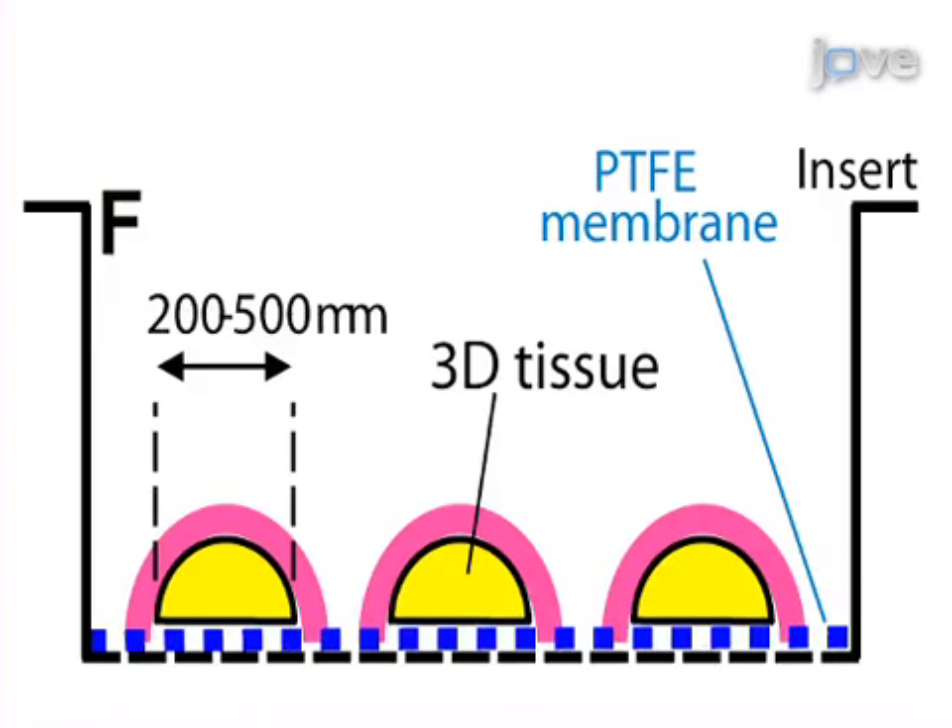Next, the beating clusters are dissected and plated on polytetrafluoroethylene, or PTFE, porous filters, which allows them to be maintained as long-term air-liquid cultures.